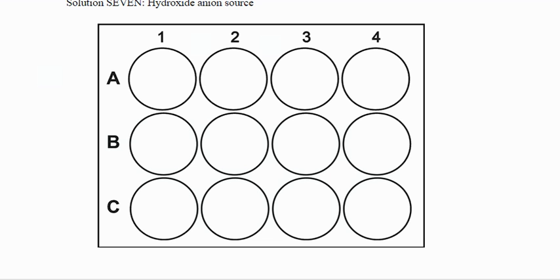You're going to have 12 wells. You're only going to be using 8 of them. I'll let you organize how you're going to do it. If I were you, I would draw this because this would be a good thing to have in your comp book or in your groups when you are doing this lab. It may help as a graphic organizer and in deciding your procedure.